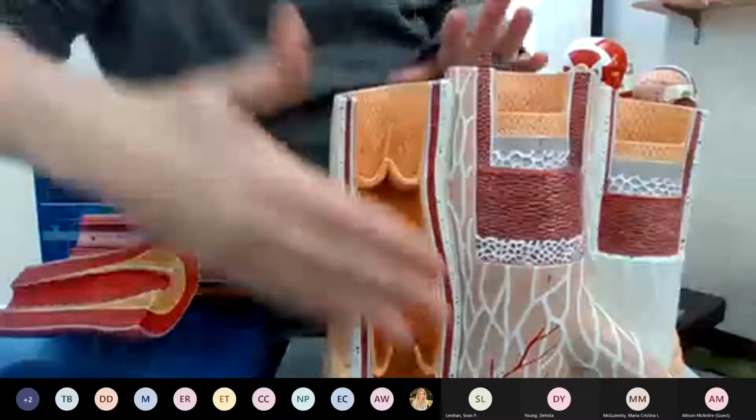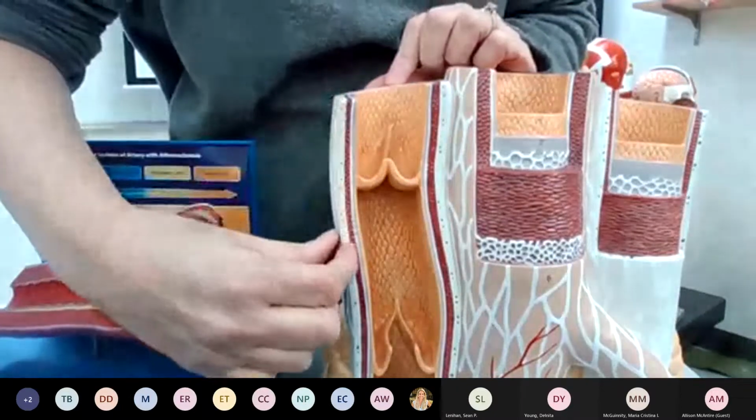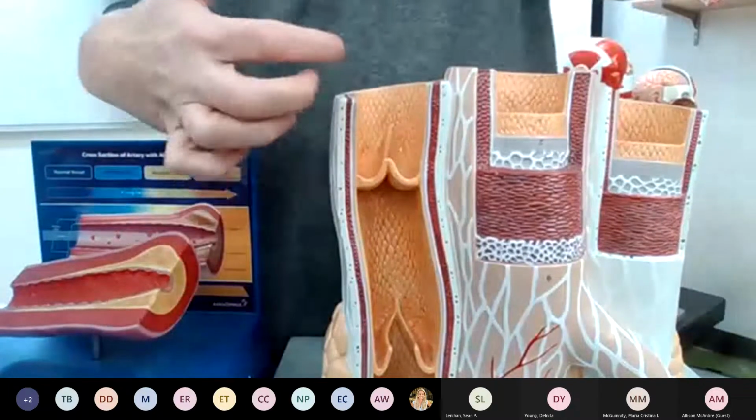Okay. Now, on the veins, you're going to see that the tunica externa is going to be a little bit thicker, and it might even completely overpower the tunica media layer.